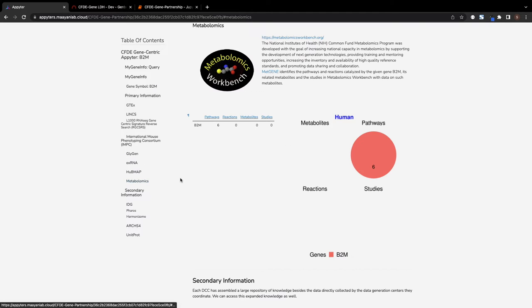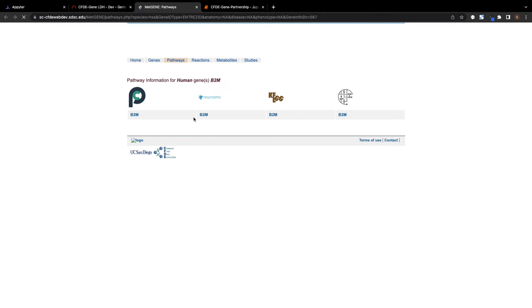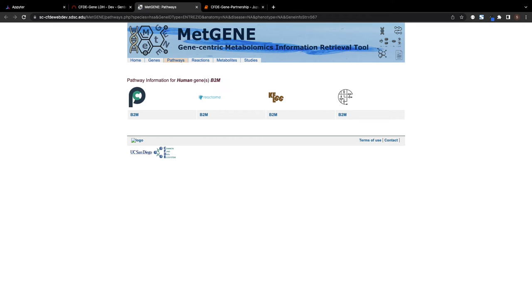The Metabolomics Workbench MetGene API retrieves knowledge from a database of metabolite analyses and provides information on pathways and reactions catalyzed by the protein that the gene gives rise to if it is part of a metabolic pathway.